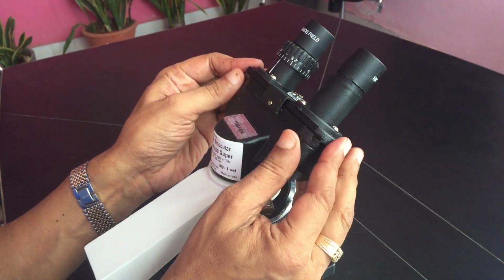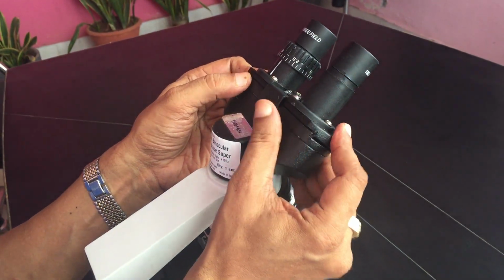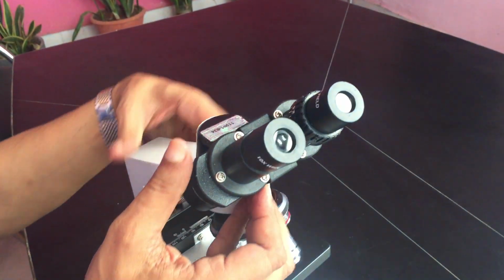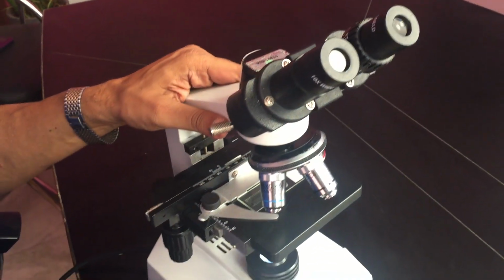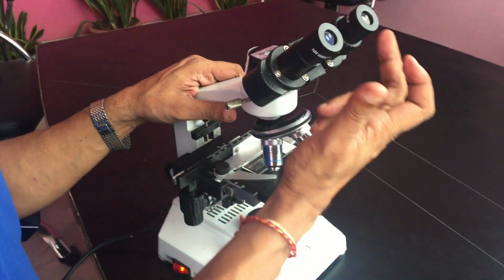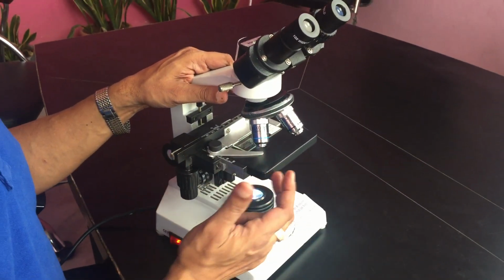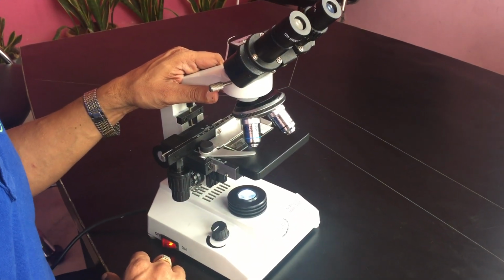Then there is a distance adjustment, the interpupillary distance. This is the distance between the two eyes. You can put this and adjust it. This is for using the head and objective setting optimally so that you can see through the eyepiece with both eyes properly. And the condenser can be used to increase the contrast of the specimen.